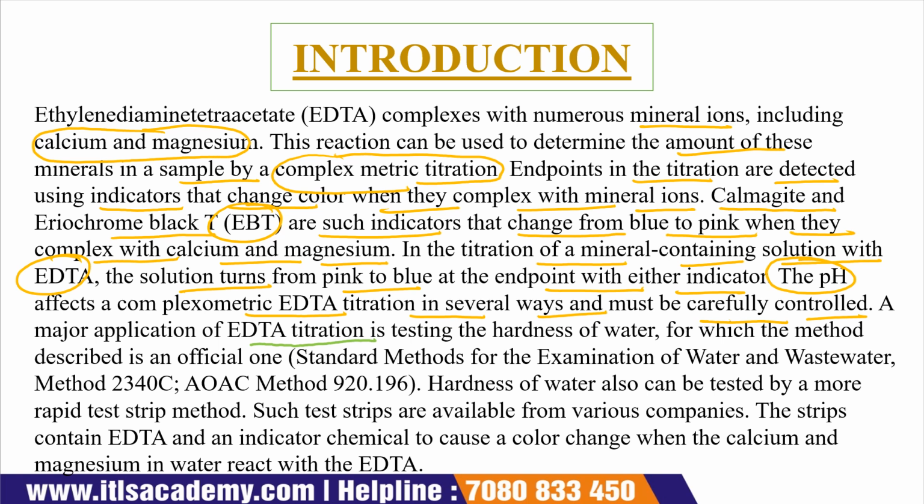The EDTA titration technique has a major application: it is used to test the hardness of water, for which the method described is an official one. That method is called Standard Methods for the Examination of Water and Wastewater, method 2340C, and AOAC method 920.196. This is the method that we use for the determination of the hardness of water with the help of this EDTA.